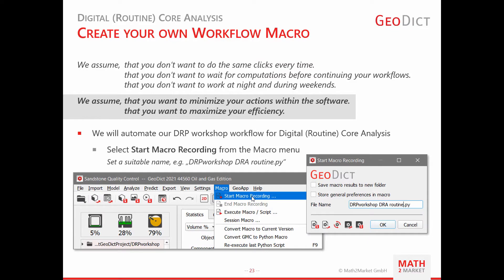Since the sandstone structure is suitable, we will start to perform our digital rock analysis. If you have multiple digital rocks and need to perform an entire digital rock analysis for each of them, you don't want to do the same clicks every time, or wait for computations before continuing, or work nights and weekends to get results. Instead, we want to minimize actions within the software and maximize efficiency — that's why we will now automate our digital rock physics workflow for routine digital core analysis.